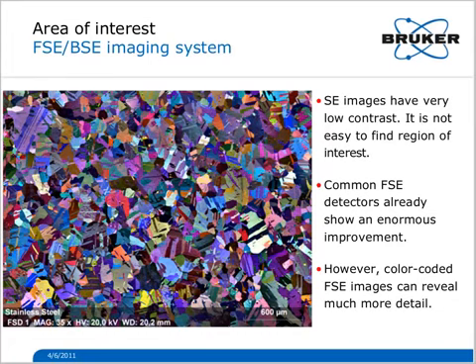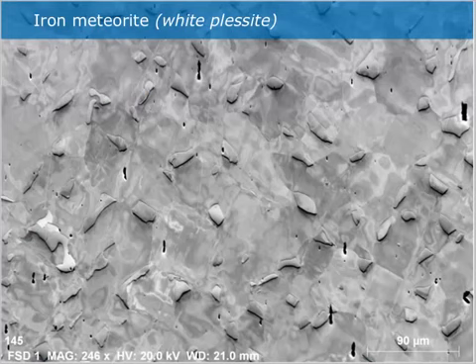This helps you much better to find a region of interest, of course, if you want to define your map, and that's a very helpful feature in the preparation of your measurement.